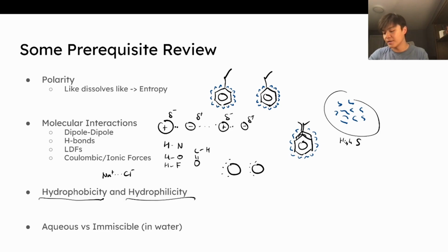If you put water on it and you try to shake it off, some of it still stays on because your skin is still a little hydrophilic. Something else that is hydrophilic: salt, right? Salt is very hydrophilic. Just think of any polar compound, right?